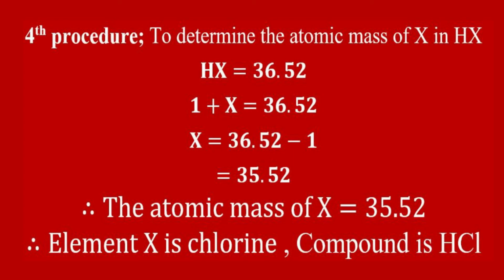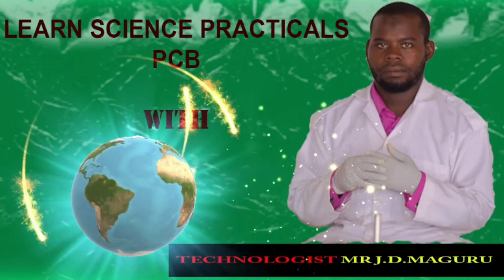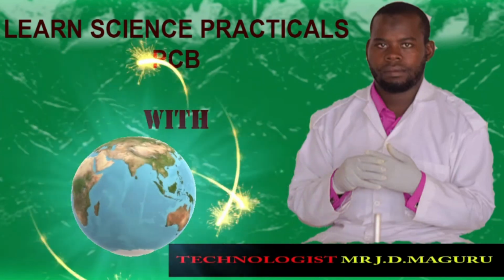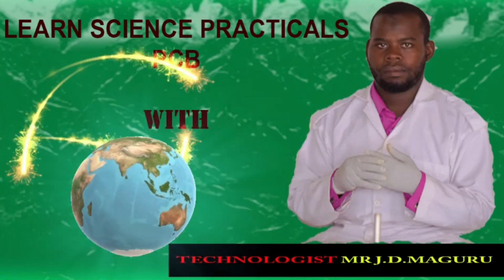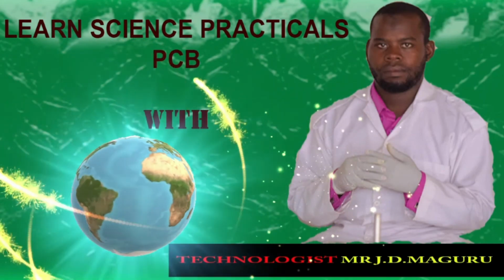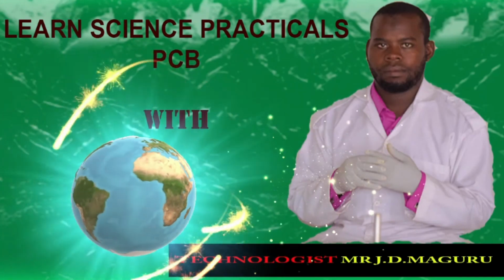According to that value, element X is chlorine, and that is the atomic mass of X. So our compound was hydrogen chloride. I think that was the end of our equation. So you are supposed to show the solution as we have solved it there, in order to understand the experiment, even one which is different from this experiment.